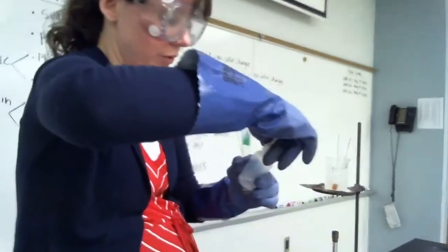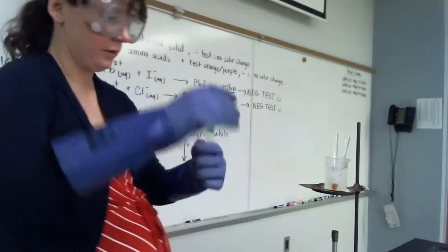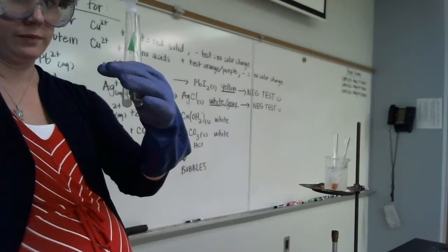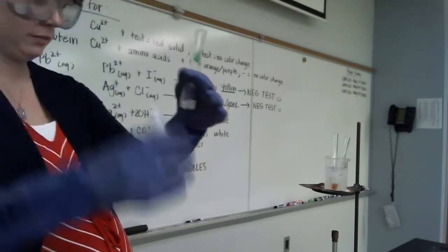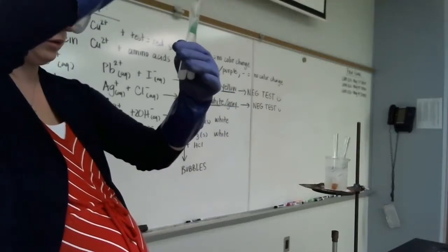Let's add calcium to them both. See what we get. Try to make it equal volumes.